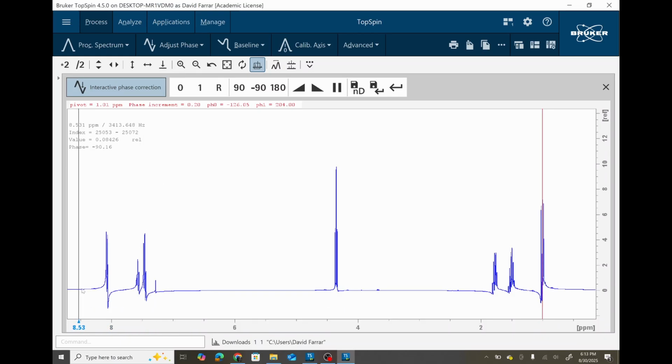You can see this peak all the way to the left here around 8 ppm. We have it sloping upward instead of being fairly sharp, and then it dips below the baseline before it returns back, and we have that pattern multiple times on these peaks. This one we have just slightly out of phase, but then at this end we have the phasing off again where it's dipping and then going up and then slowly returning back to a baseline. This is poorly phased.